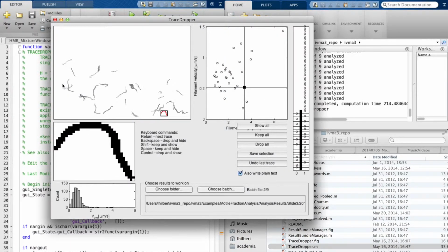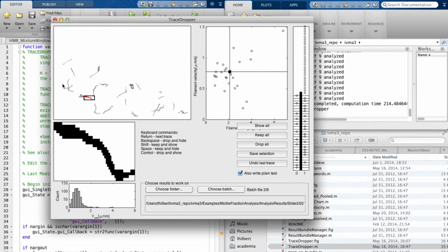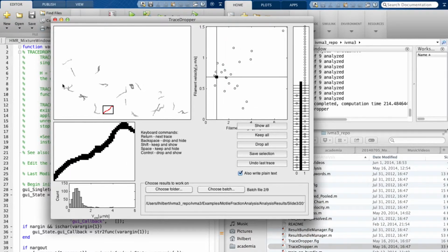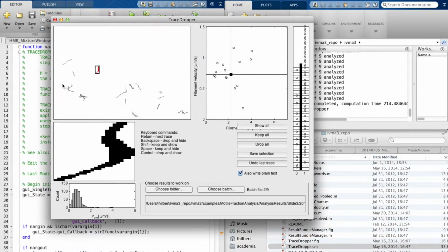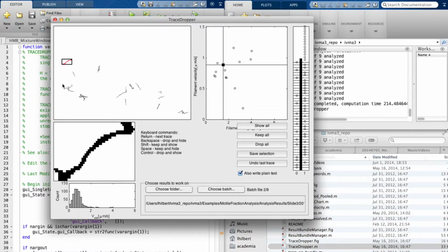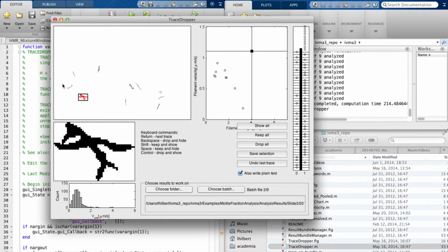All this is always a little bit of a question of your own eye measure. There is no 100% solid rule for how to reject these, but if you see something too curly, or clearly crossing over where you can see two filament shapes, then you might want to get rid of it. Like here, for example, that should go. You can keep this one. Like here, you see two filaments crossing. They really have to go.